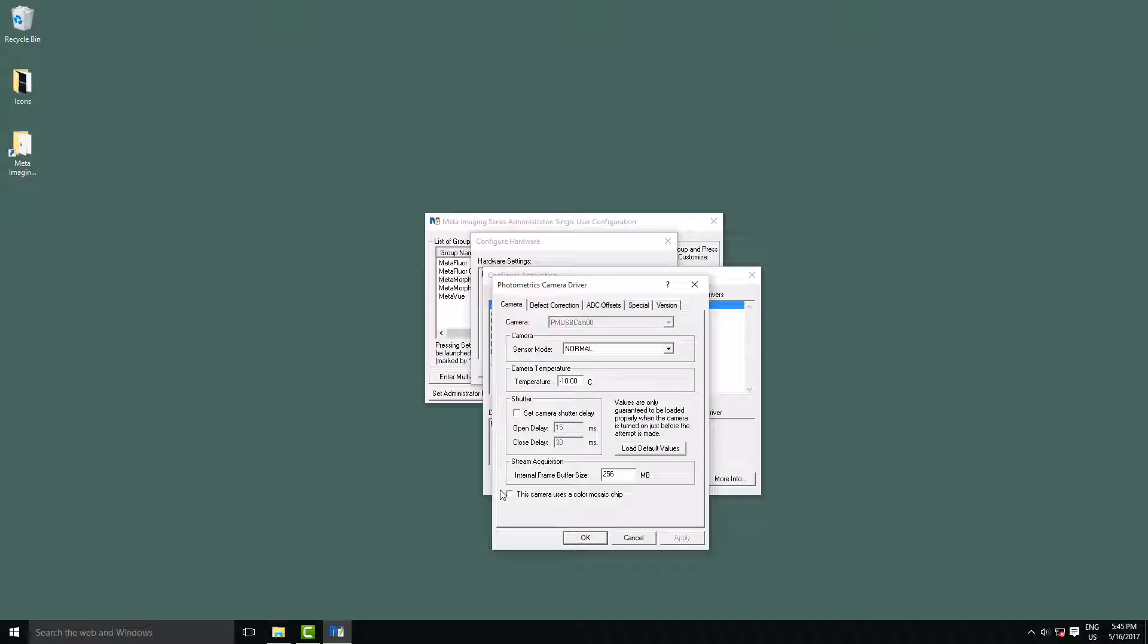Finally, stream acquisition internal frame buffer size. This is what determines how much RAM to give over to the streaming function of the camera. Typically you'd want to give over about half the RAM of your computer to this to get really smooth acquisition.